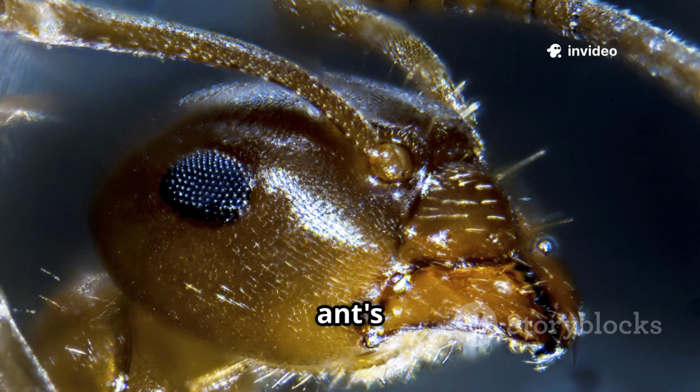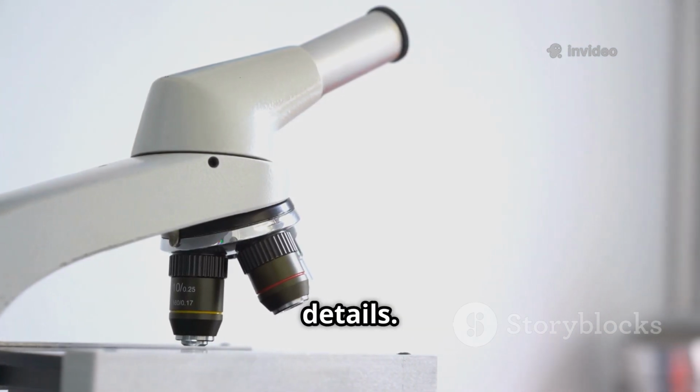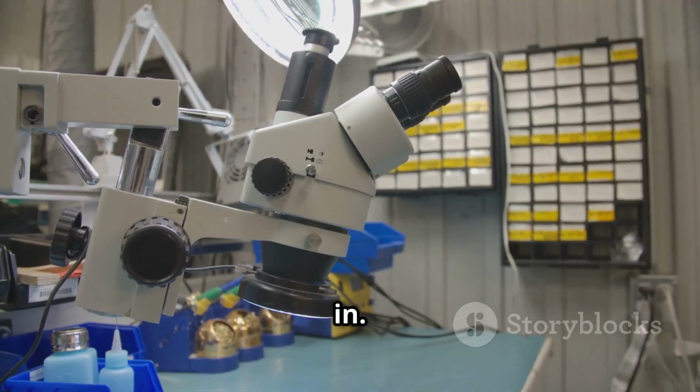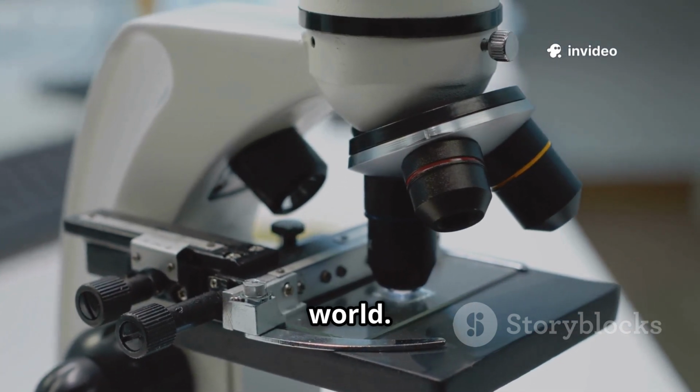Ever wondered what an ant's eye or a grain of salt looks like up close? Regular microscopes can't show us the tiniest details. That's where the scanning electron microscope, or SEM, comes in. Instead of light, SEMs use a beam of electrons to reveal the hidden textures and structures of the microscopic world.